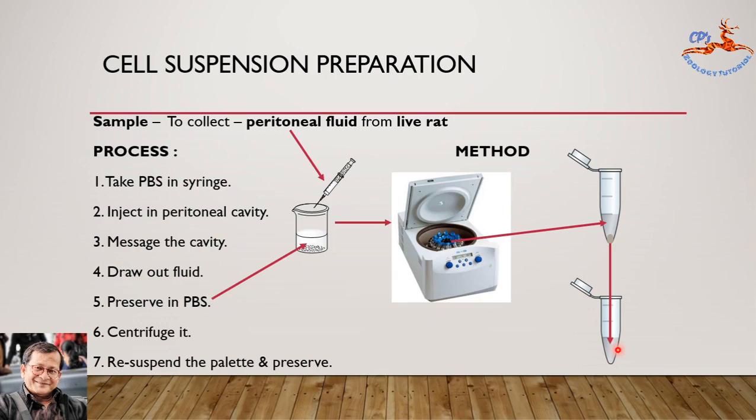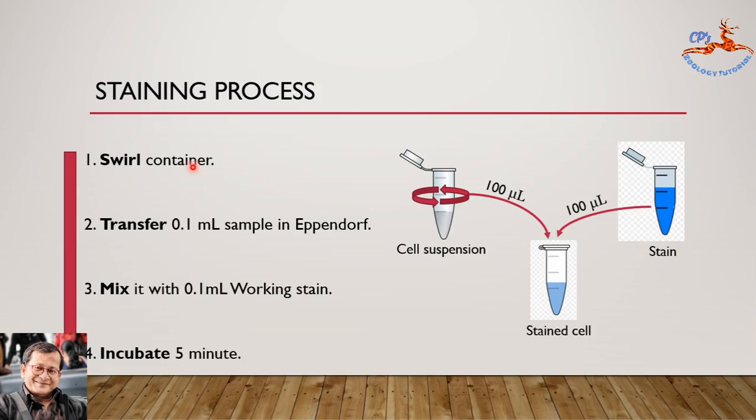Now come to the staining process. Our second step is to stain those cells suspended in the sample. First, hold by hand or keep in the vortex machine to swirl the container so that the cells are evenly distributed. Then take out 100 microliters (0.1 ml) of cell suspension using a P200 Gilson pipette and keep it in a fresh Eppendorf tube. Now mix it with 100 microliters (0.1 ml) of 0.4% freshly prepared working solution of Trypan blue at a 1:1 ratio, vortex it for mixing, then incubate for 5 minutes at room temperature.